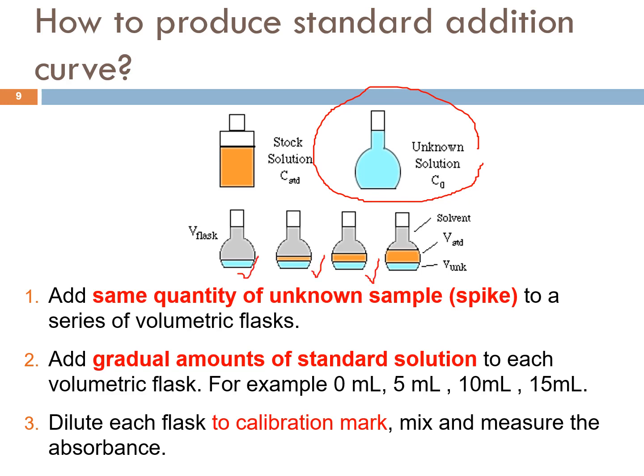Contoh kata tadi, dalam calibration curve tadi kita guna water, nak detect ferrum dalam river kan. So kita masukkan dulu yang biru ni, contoh kata adalah sample water from the river, and then stock solution ni adalah ferrum, kita punya commercial ferrum. Okay, so kita akan add different amount of ferrum standard solution inside your sample.